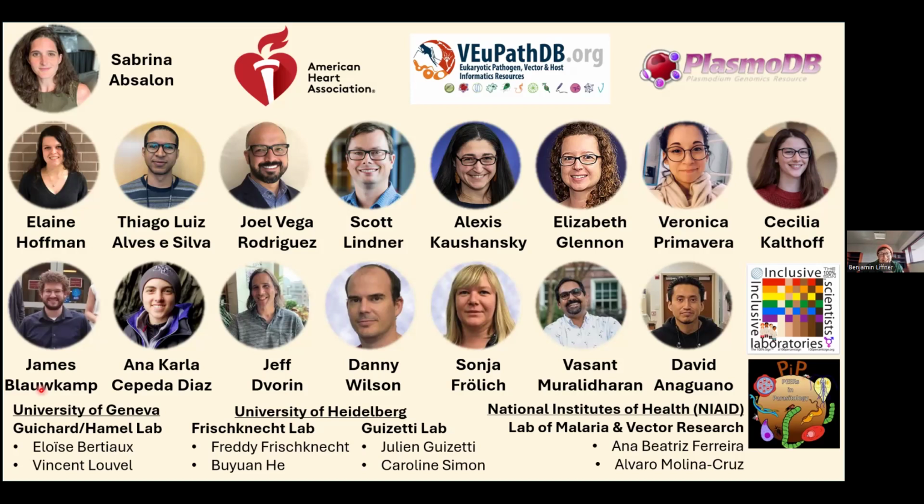So this is completely dependent on what the tissue is. I have said this as these mosquito tissues, which is completely true. However, we basically use a regular ultrastructure expansion microscopy protocol. The reason for that is that while these are tissues, we reason that effectively they are bilayers of cells. On either side of that tissue, you only have one epithelial cell in theory. So thankfully for us, these are tissues that are small enough that we can treat them like they're a monolayer of cells, and the denaturation step of expansion is enough to clear the tissues.